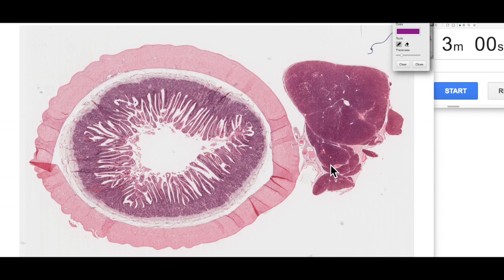Hi, 3 Minute Histology here with Jamie Chapman. Today we're going to go right back to the basics of having a look at stains and what stains can tell you about slides — how you begin to interpret your slides even from a basic low-magnified view. So what the different stains mean, what they stain, and how you can begin your interpretation. Let's start our three minutes.